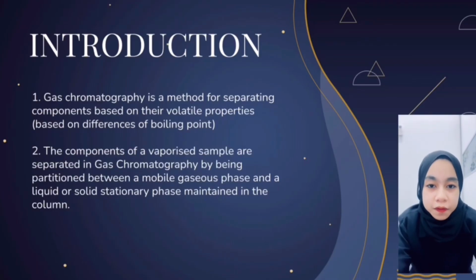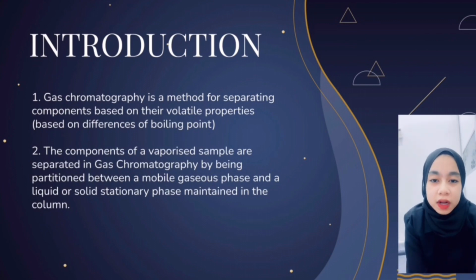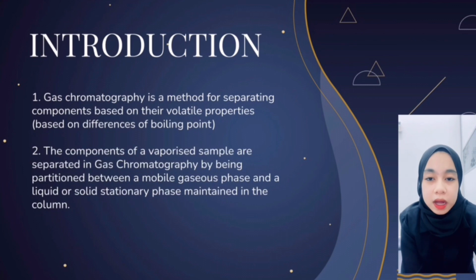Gas chromatography is a technique for separating components depending on their volatilities, based on differences in boiling point. Second, in gas chromatography, the components of a vaporized sample are separated as a result of being partitioned between a mobile gas phase and a liquid or solid stationary phase held in a column.